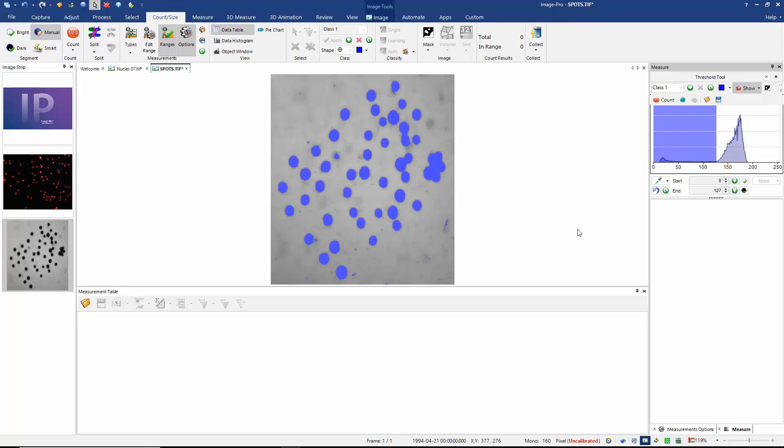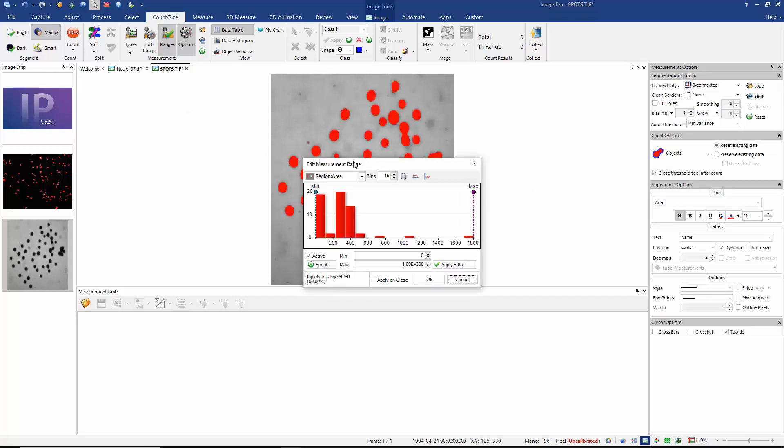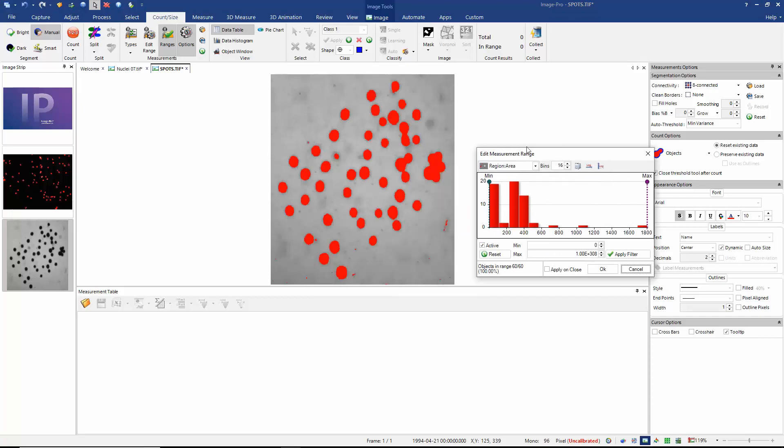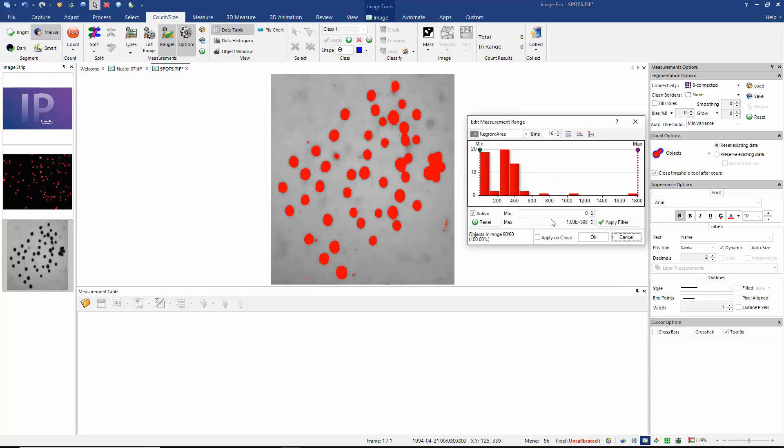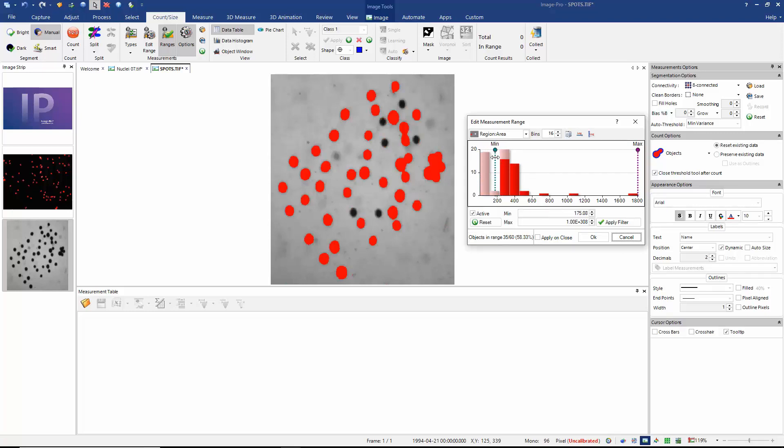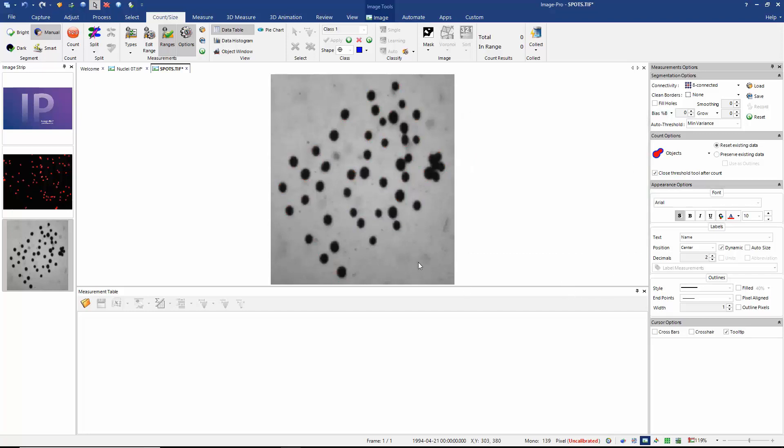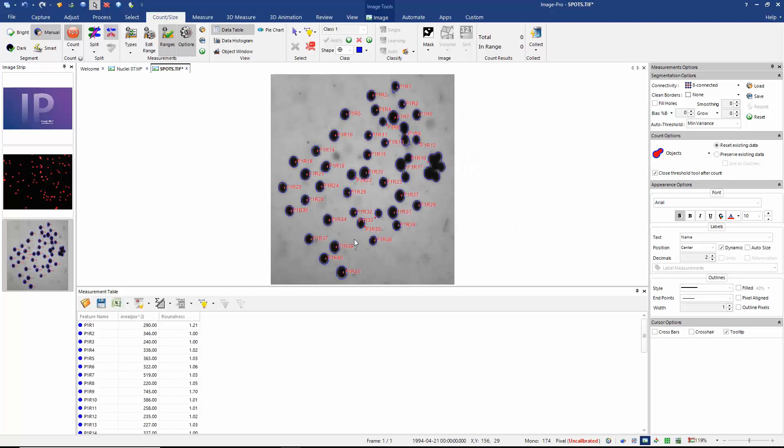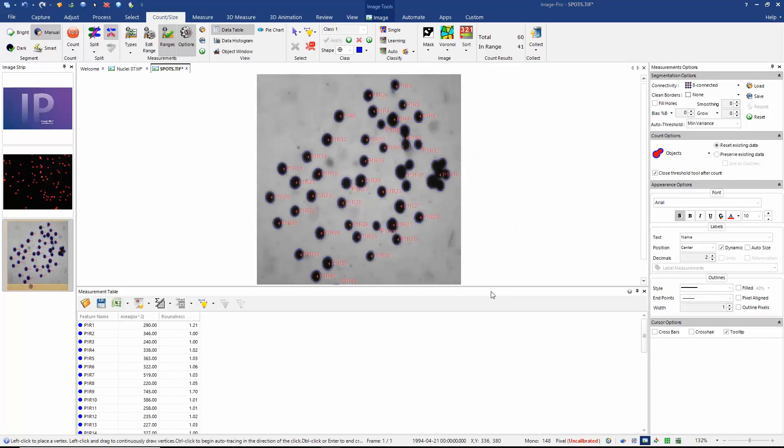I think again, I'm going to use a range. So let's edit range. And let's look at the minimum area that we're going to accept. So we can move this minimum setting until we exclude all of the objects that we don't feel are valid. So I think that looks pretty good. I say OK and choose the option to count.